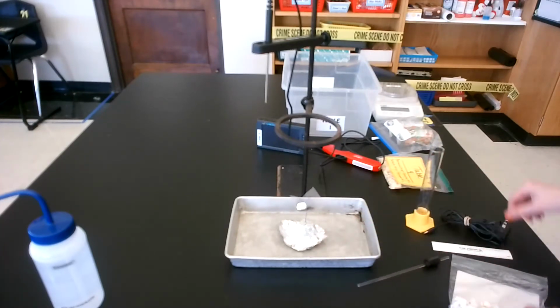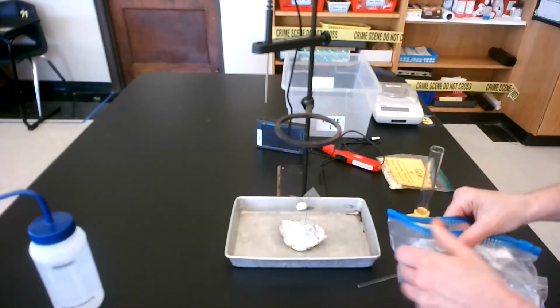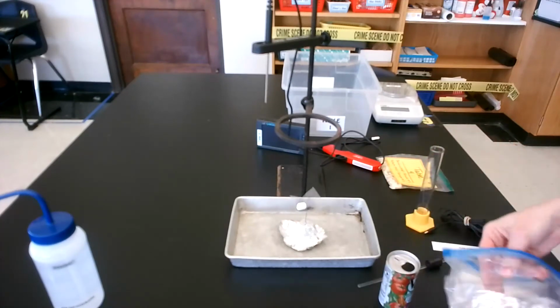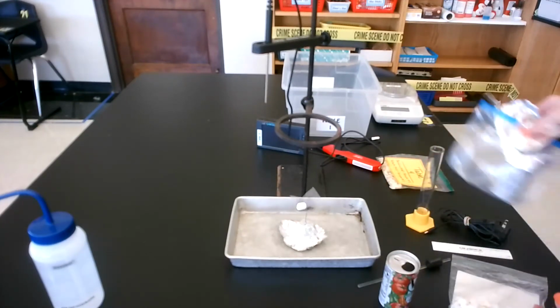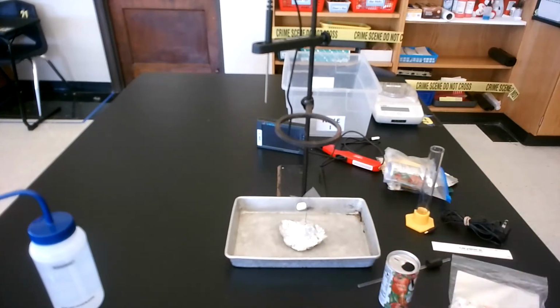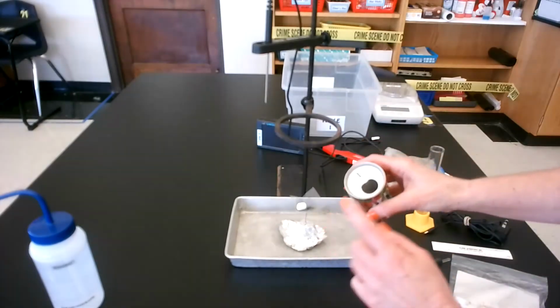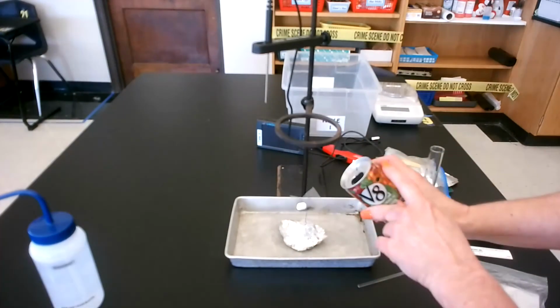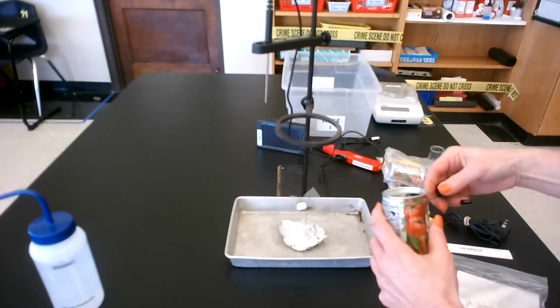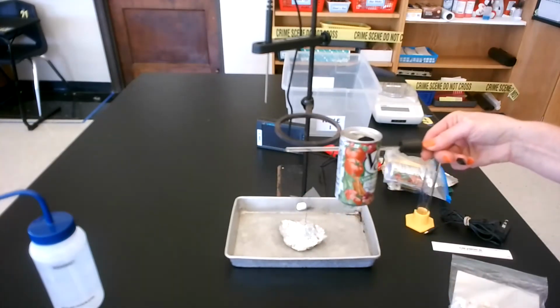Then I need to do my can. I've got 2 cans, and they're labeled 1 and 2, so it doesn't matter which one you use first. And then you also have some foil in here. We need to try to make it as close to a closed system as we can. You notice there's obviously the hole where you drink out of, but there's also 2 holes on the side. This is where I'm going to put the stirring rod, because the glass is not going to conduct heat, and we're going to suspend this.